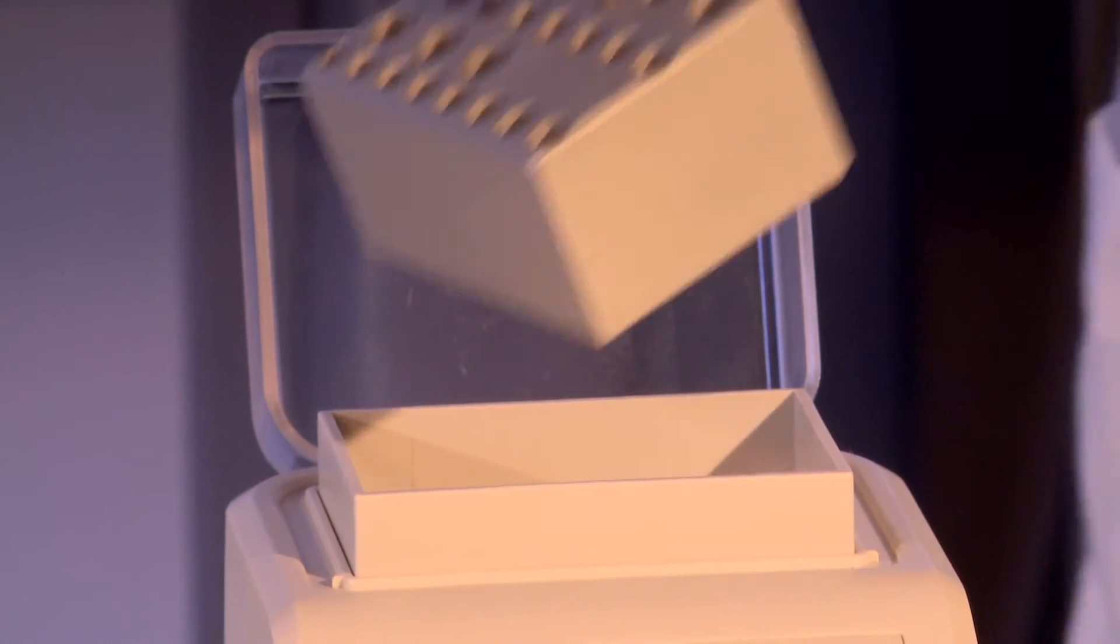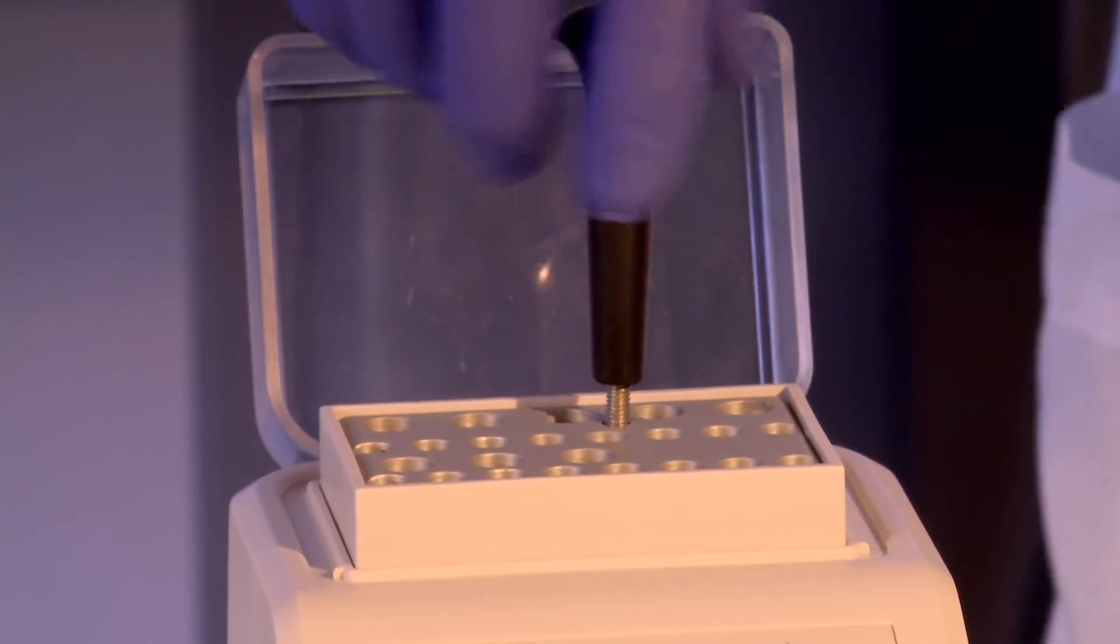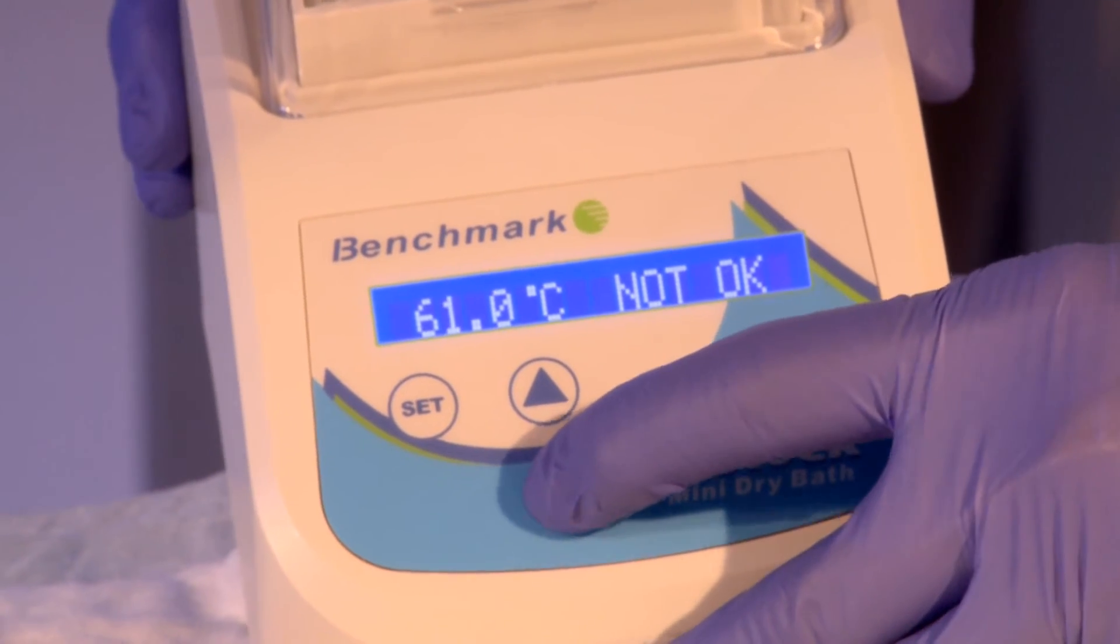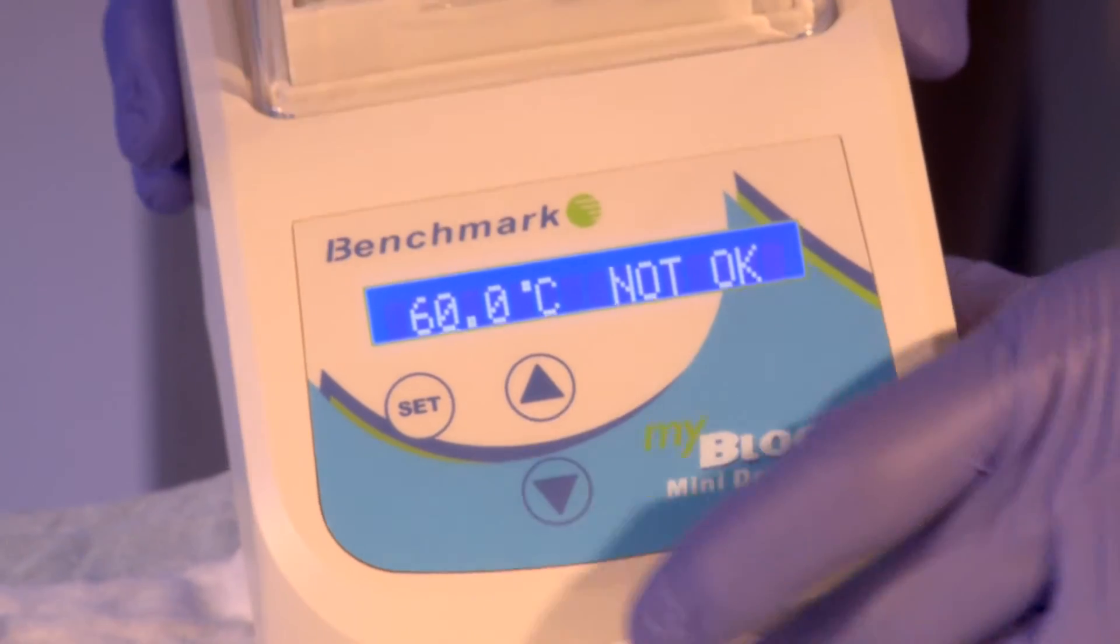Then return it to the internal heat plate and allow the block to reach the target temperature. In this case, we will be performing the PC-run reactions at 60 degrees centigrade.